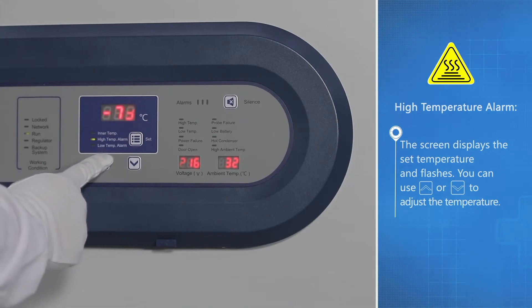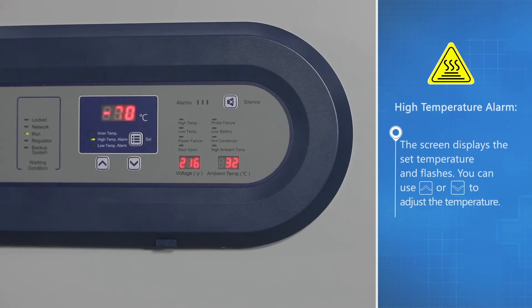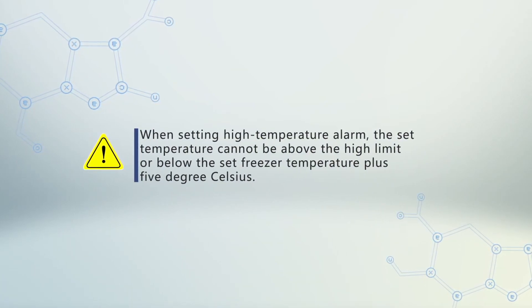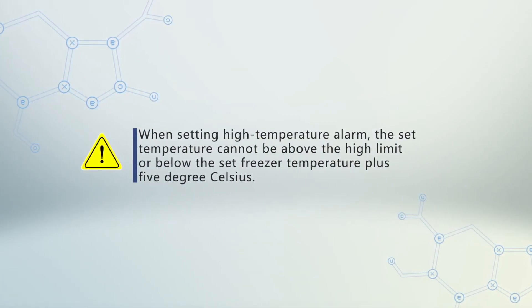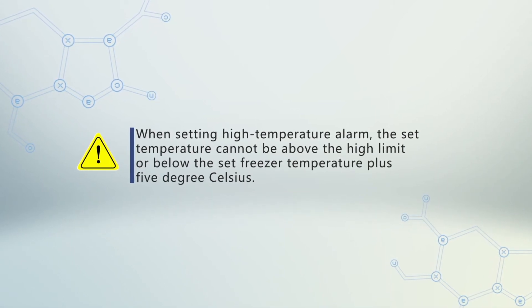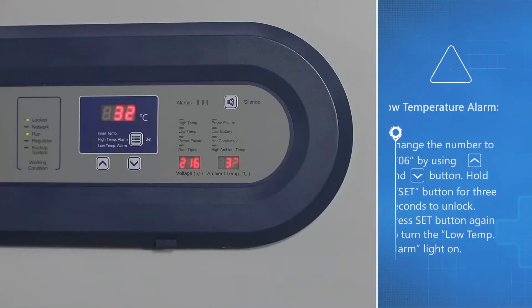The screen flashes and you can use up or down to adjust the temperature. When setting the high temperature alarm, the set temperature cannot be above the high limit or below the set freezer temperature plus 5 degrees Celsius.